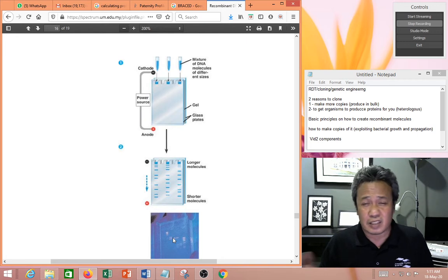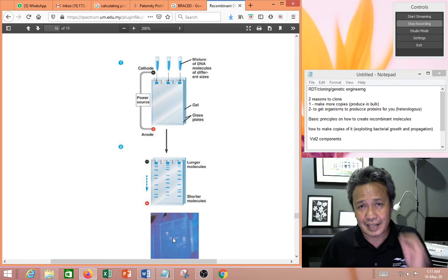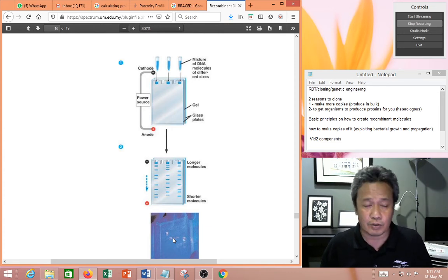You can use other systems to label your DNA and then view them. But DNA on its own, you will not be able to see it. So this is how you actually see your bands.